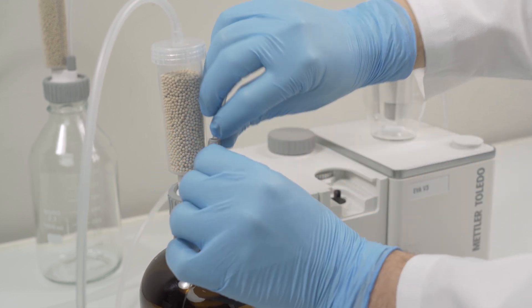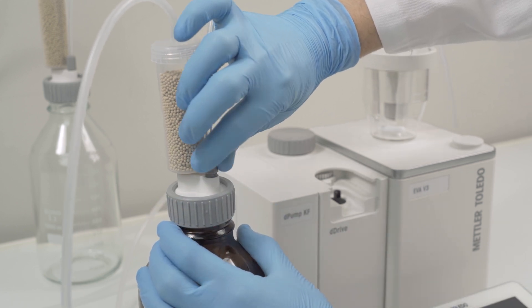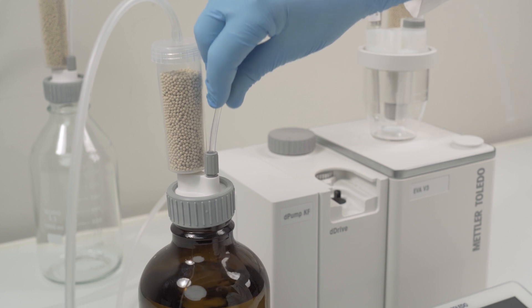Connect the solvent tube to the solvent bottle, screw it in half way and push it down until it reaches the bottom of the bottle, then fix it down.